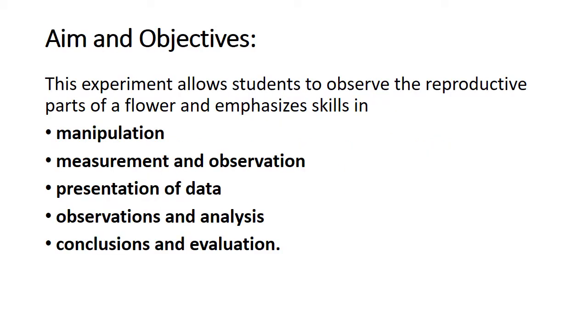Now the aim and objective of this experiment is to allow students to observe the reproductive parts of a flower and emphasizes skills in the following: manipulation, measurement and observation, presentation of data, observation and analysis, and conclusions and evaluation.